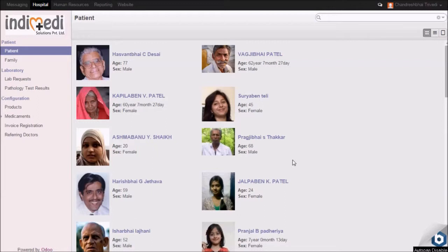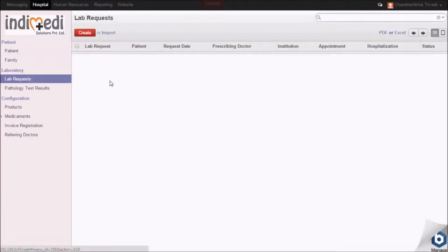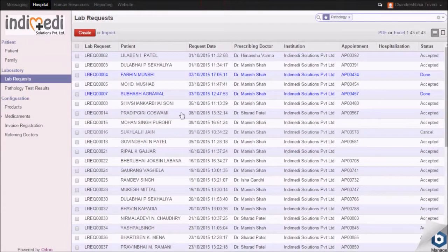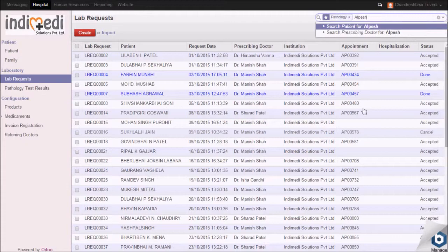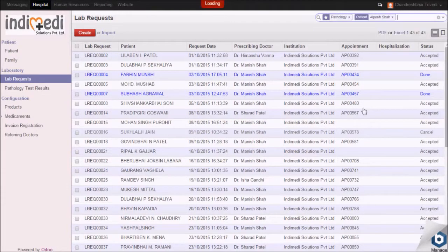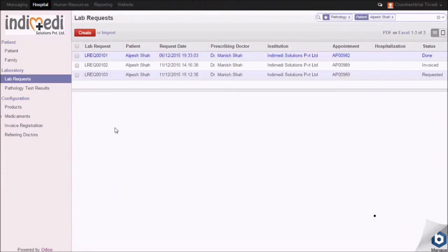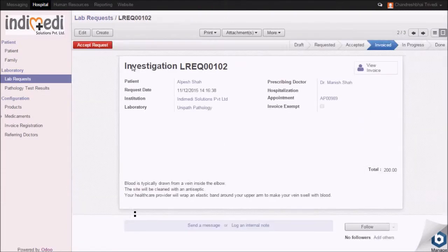Once the invoicing for the lab reports is done, you have to move to the lab request menu. Select and click on the name of the concerned patient from the list visible on your screen.